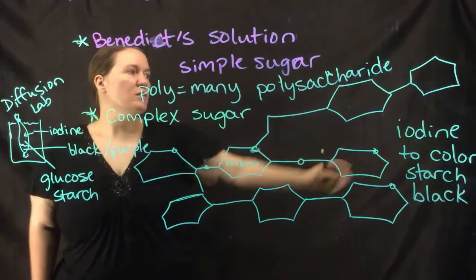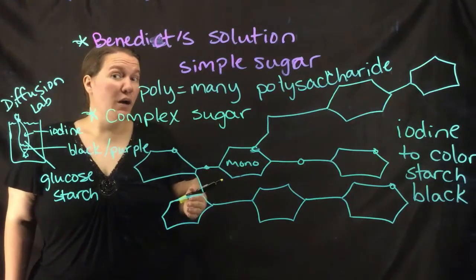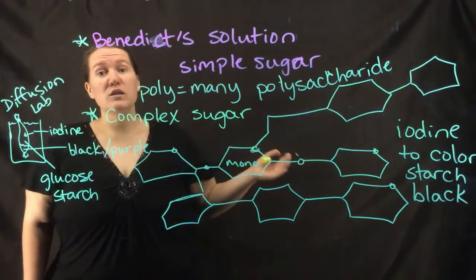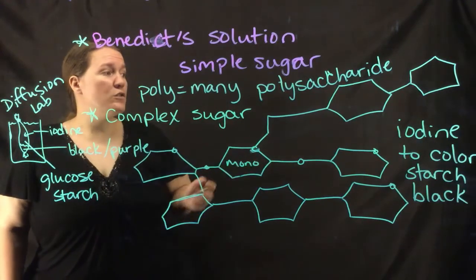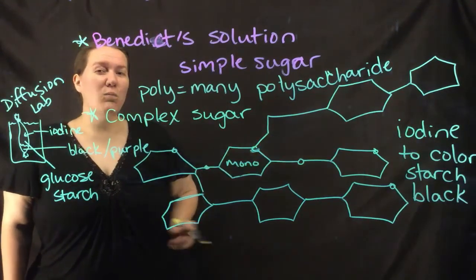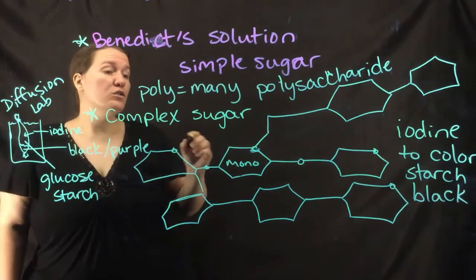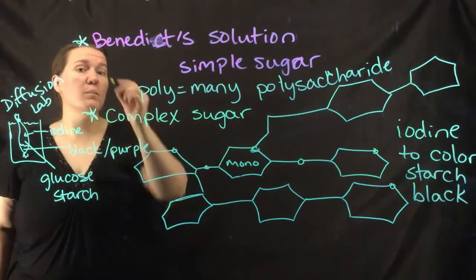And when it's a positive result for starch, which cornstarch is a definite positive, right? You're saying starch in the name of cornstarch, so you should be pretty right on, knowing that that's your positive control, and see that coal black color form. And then you compare that to the polysaccharide starch from potato.